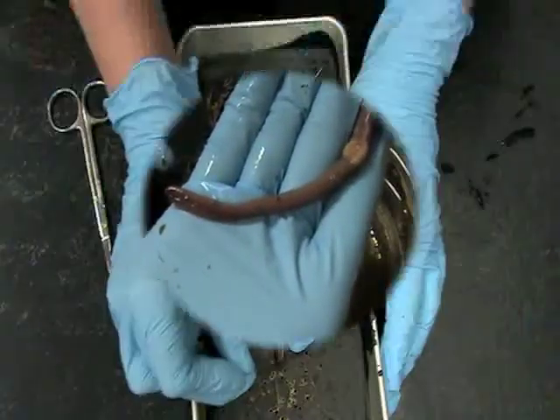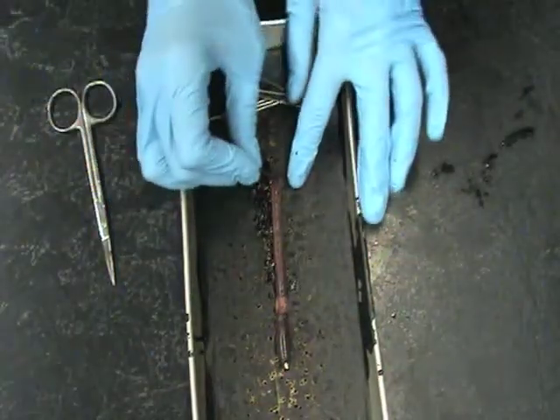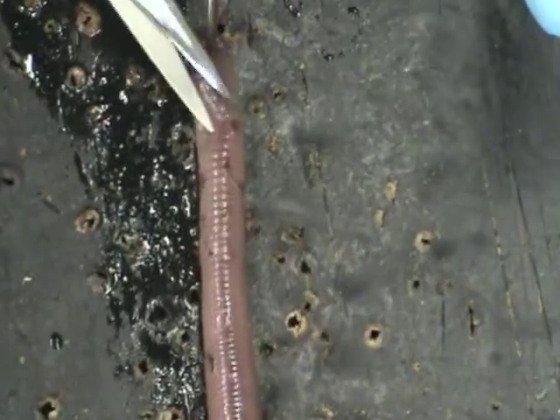Place the specimen dorsal side up, pin the anterior and posterior ends of the worm into the tray, and begin snipping. Be careful not to harm the organs.